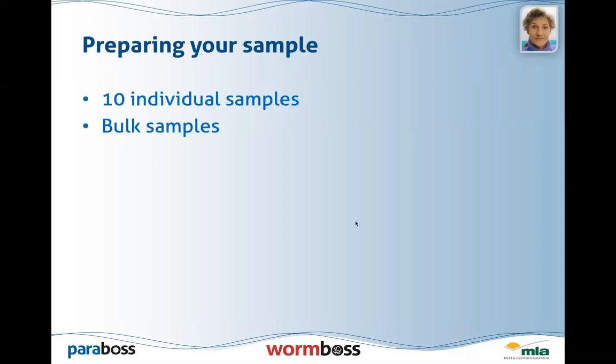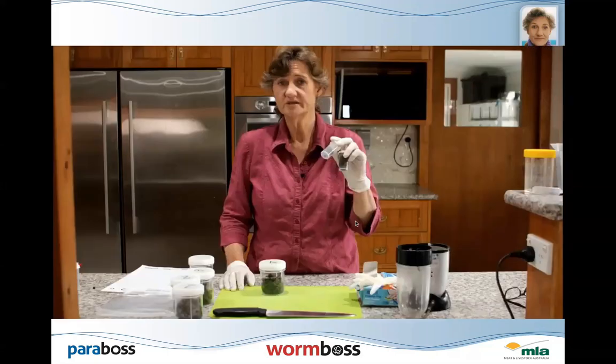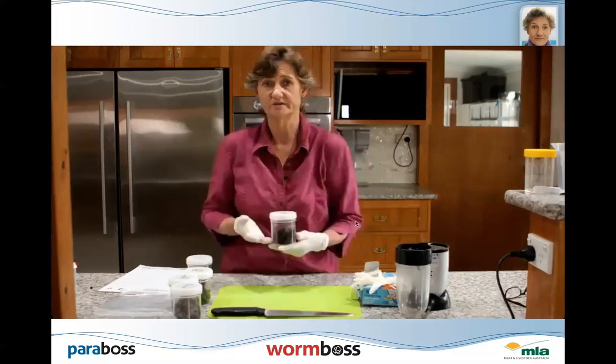Now, the following animation is just a short snippet of mixing samples. But you should see our other webinar that's coming up called Bulk Worm Tests Increase Accuracy. Now you can see here I'm holding a couple of the individual samples, but I've got in front of me a larger jar of feces that we can mix up for a bulk sample.